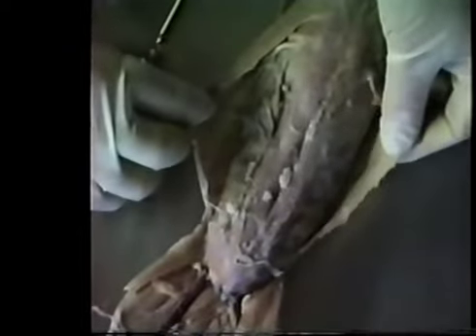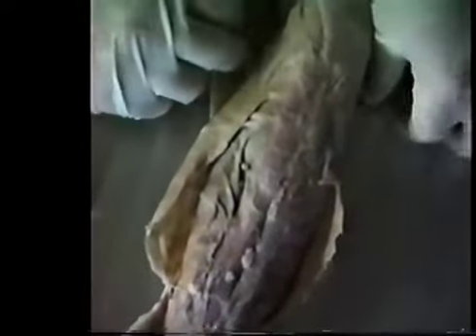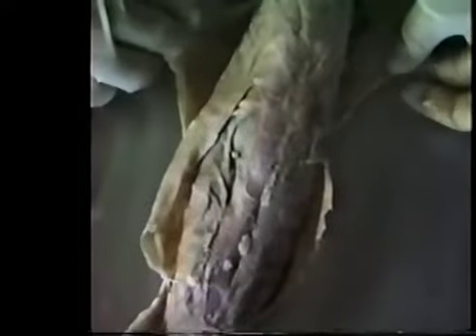This muscle and this muscle are the external oblique muscles. Don't confuse them with the latissimus dorsi. Latissimus dorsi are up much higher. Here are the latissimus dorsi muscles.